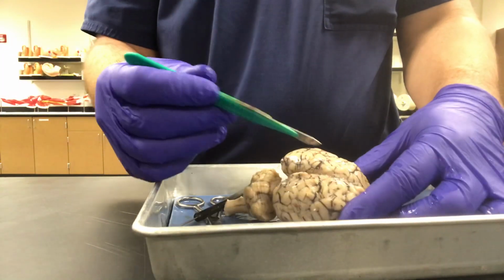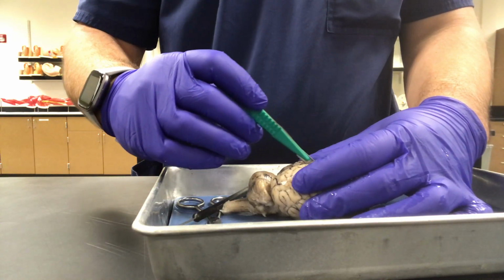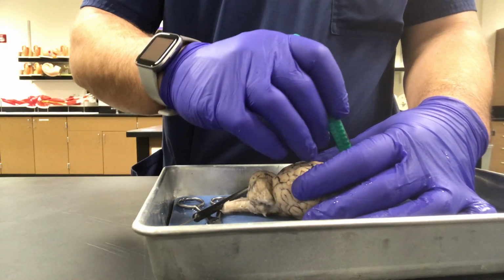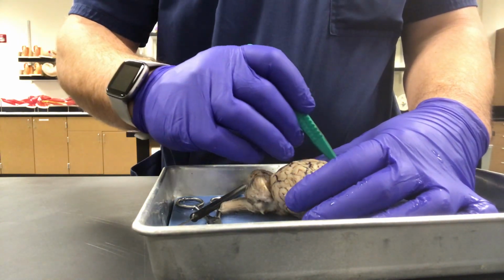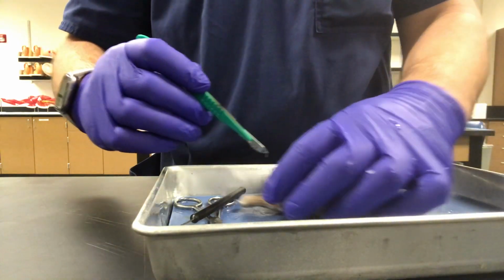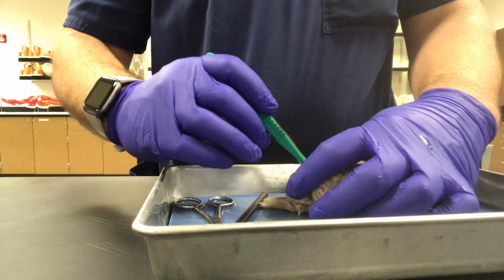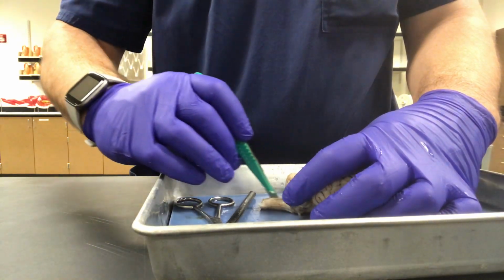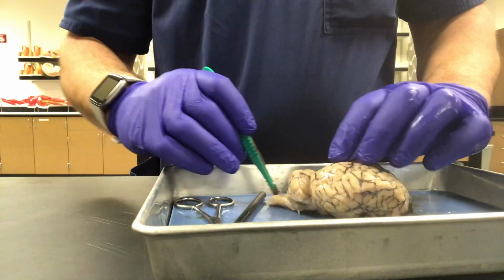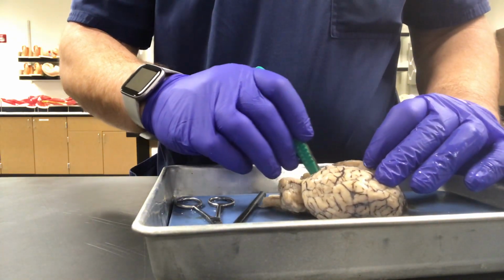Next, we'll dissect into the brain. Just going to cut it down the middle. Nothing special, incredibly boring dissection. The reason why we're going through this is because the brain will technically be on the final exam dissected, either a live specimen, assuming we're in class, or a virtual specimen if we have to do this online. But you will see a dissected version of a brain.